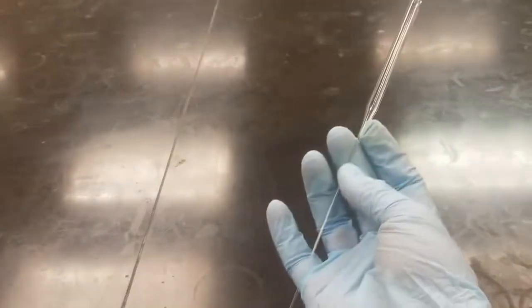All right, so next up we're going to make our cotton filter pipette. So you can see I've got a long pipette here, and then I've got a little ball of cotton. And the key here is that you're just going to want a tiny, tiny piece of cotton. It's going to be barely visible. Right, so I'm just going to grab just this much amount of cotton, just a tiny amount.